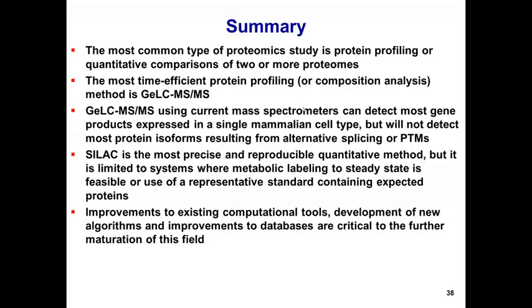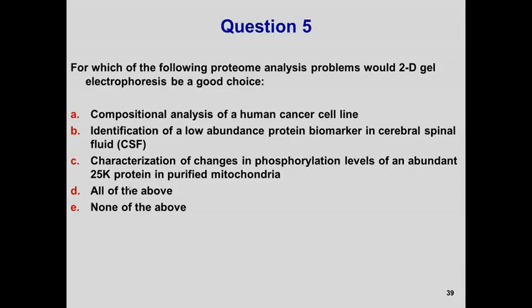The key thing is the representative standard must contain the vast majority of the proteins expected to be found in the specimen to be quantitated. Improvements to existing computational tools are important as the experimental data sets continue to increase in size.